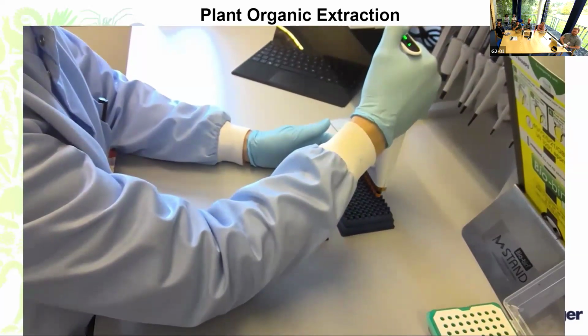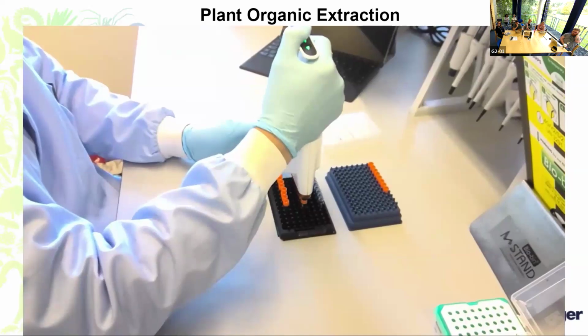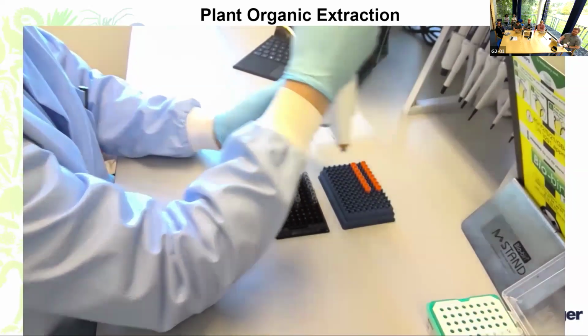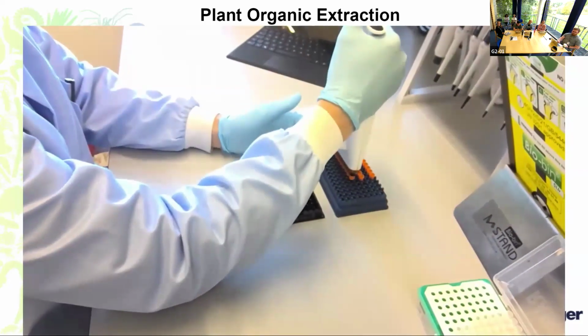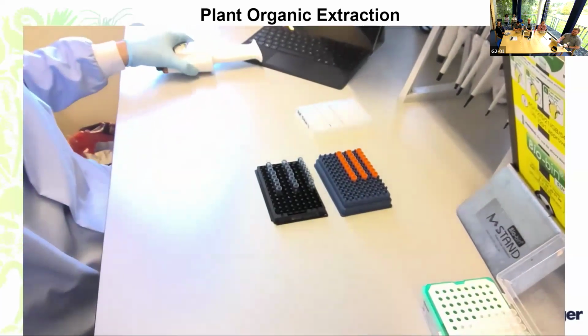After the automated extraction, which takes about 50 minutes on the KingFisher, we will then remove the lids from our tri-coded FluidX tubes, and we'll transfer the elution into here, which can then be stored overnight to solubilize the DNA, and then we proceed the following day to DNA QC.